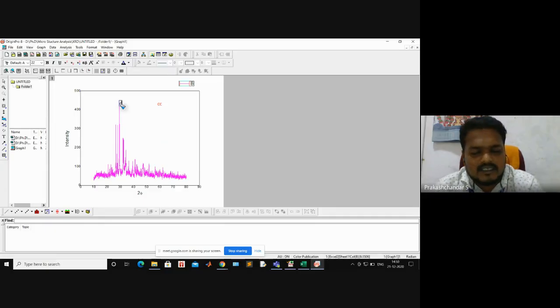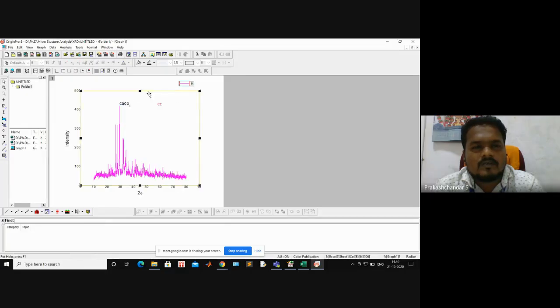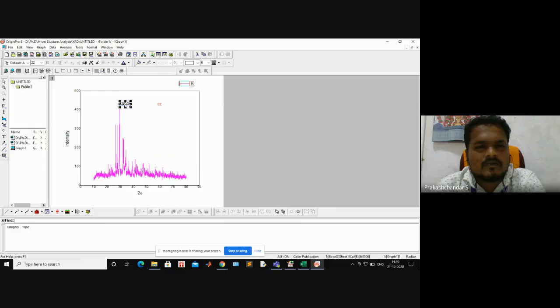This is CaCO3, CaCO3, and double click this one or right click this one, go to properties. So go to properties and make it 90° and it will be turned like that.